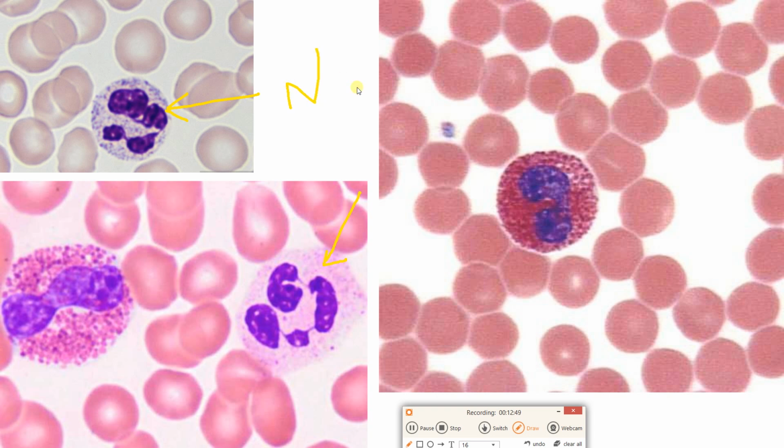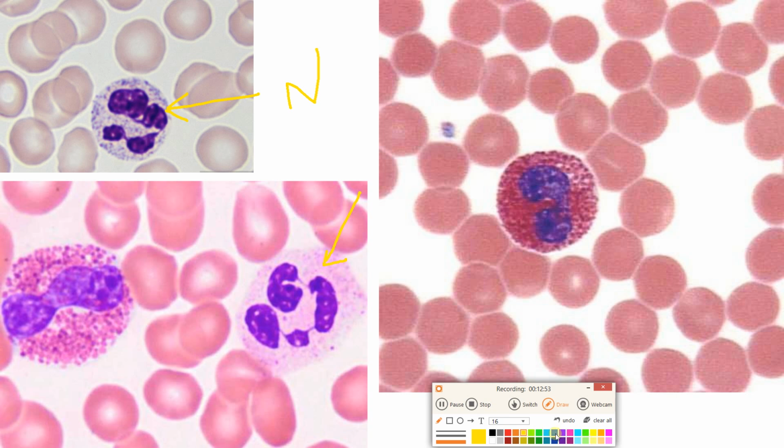They are neutrophils. And then what about this dude and this fella? I like this one. This one's probably my favorite just because of the coloration here. These guys are both eosinophils. All right, hopefully you passed that little test right there.